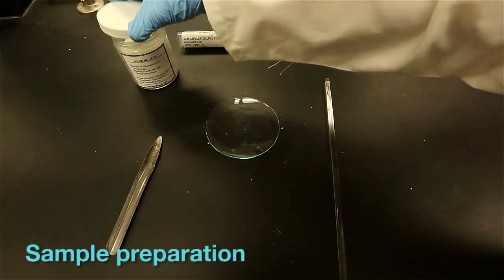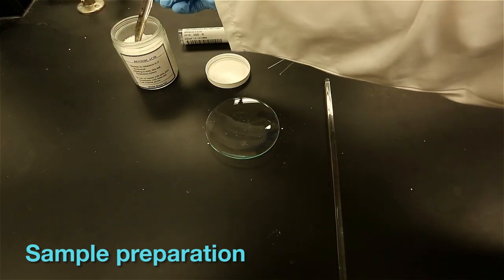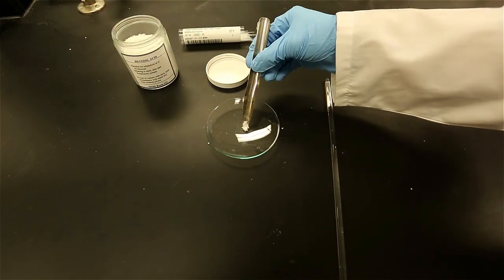To prepare your compound for melting point analysis, you must first powder the compound on a watch glass with a stirring rod or a mortar and pestle.